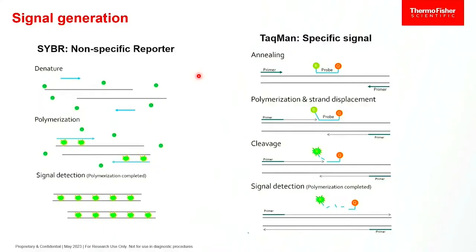And we do that spatially in Sanger sequencing: we have a molecule and we look for fluorescence of a nucleotide, and we separate that in space by passing it past our detector in a charged electromagnetic field. If we tried to do that in qPCR, we would see incorporated and unincorporated nucleotides at the same time, and we wouldn't be able to tell the difference.